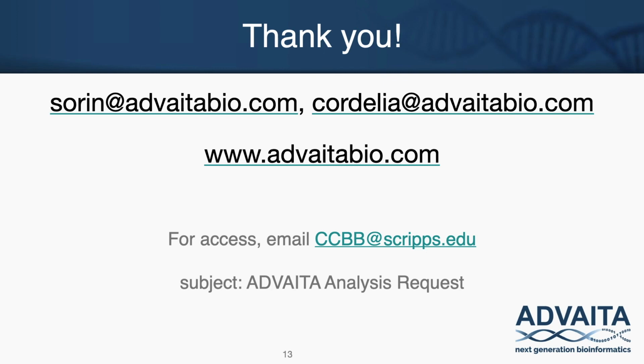Everything we did today was on what I call a shared analysis, which is what you'll be working with. All of that is available to you. When you have a subscription, when you have a purchased analysis, every single module is available to you. There's no other version of the subscription that gets more modules. Every person has access to all modules.